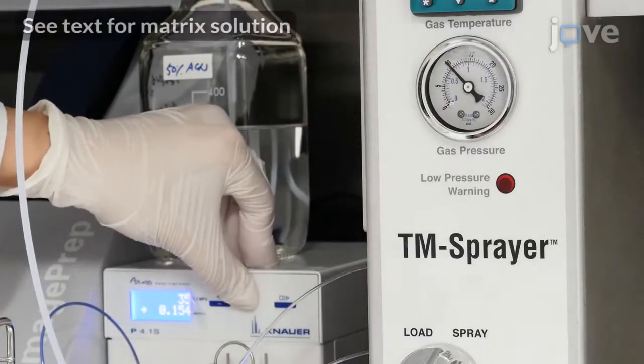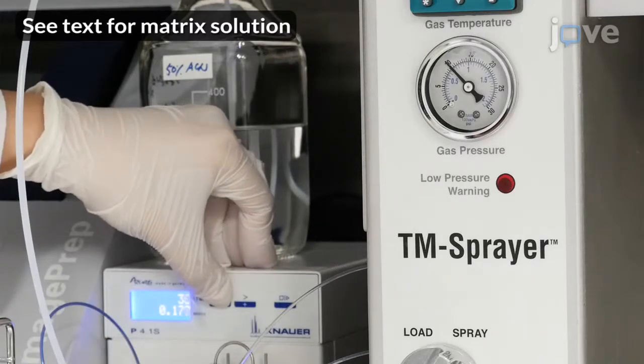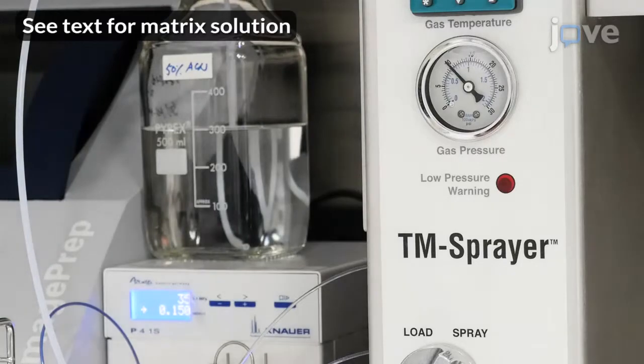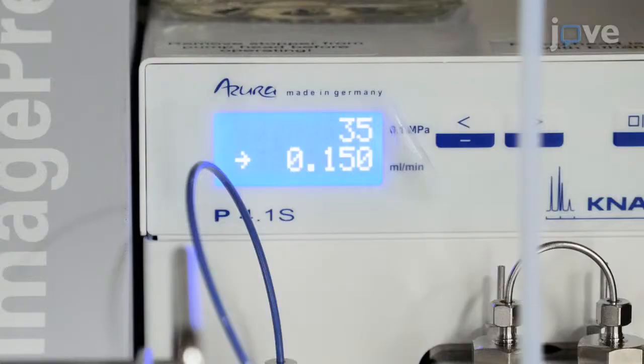Alternatively, to spray the matrix solution on the tissue surface with an automatic sprayer, use a solvent pump system set at 10 psi and 0.15 milliliters per minute to deliver the matrix solution. A constant flow of heated sheath gas will be delivered conjointly with the matrix solution spray.